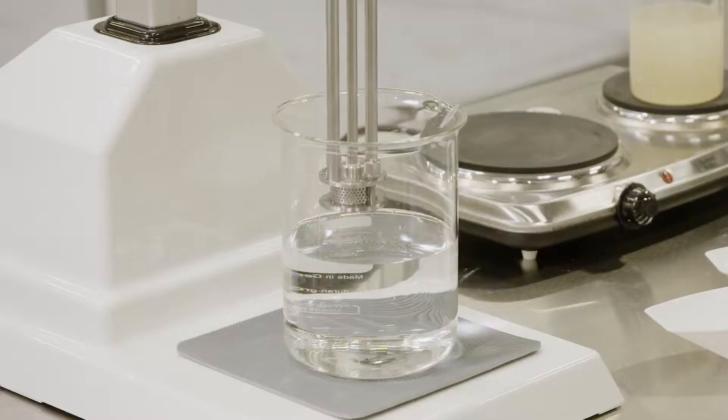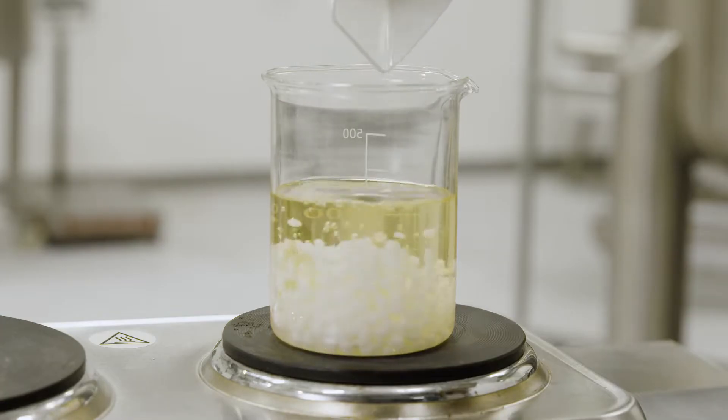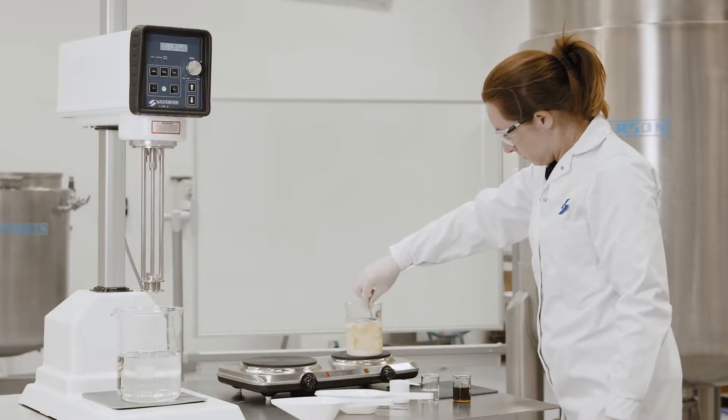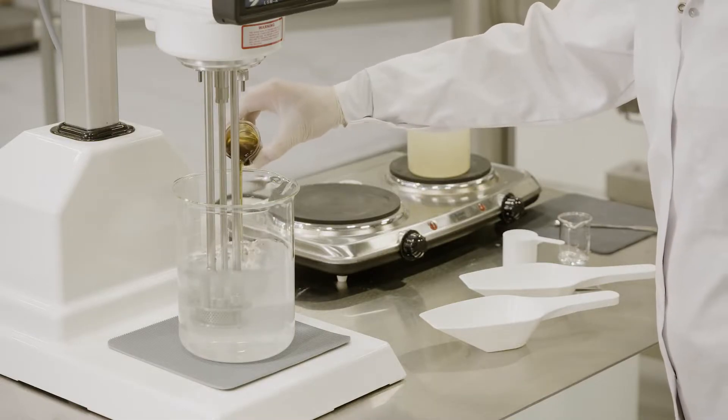Silverson mixers have been used for the production of cosmetic and pharmaceutical creams for many years, and we are at the forefront of the fast-growing industry for manufacturing of CBD oil-based products.